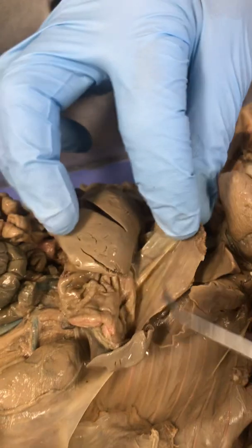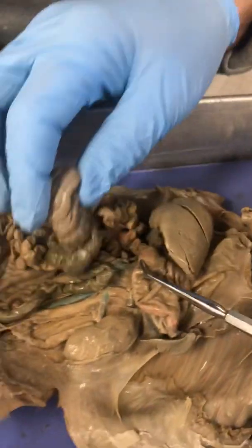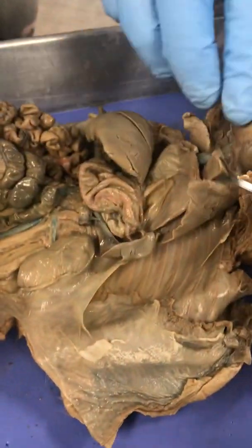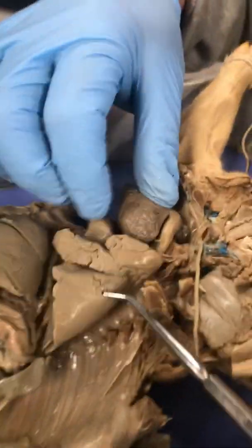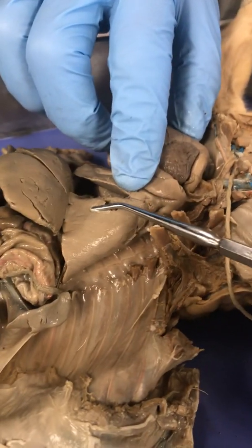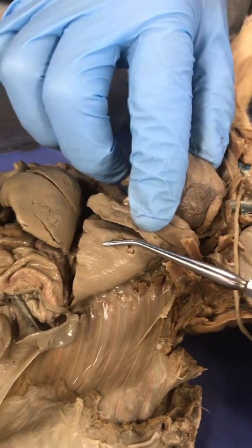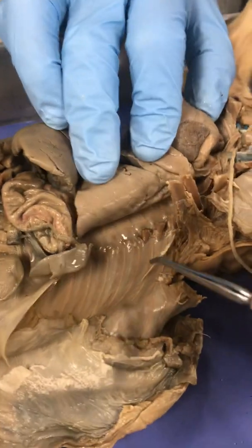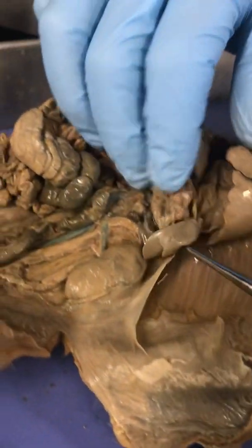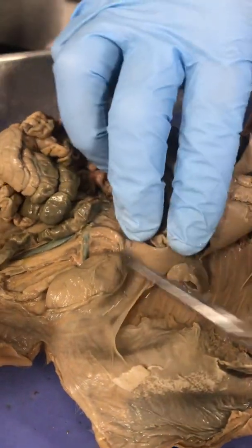Are you going to ask anything about the visceral and parietal pleura? I could. If you look at the lungs here, you can see that thin membrane covering the surface. That would be the visceral pleura right there. And then the parietal pleura would be that membrane. Of course, we've talked about the spleen, the kidneys.